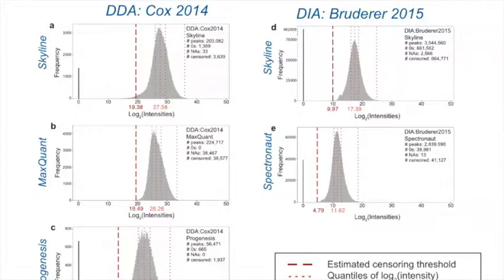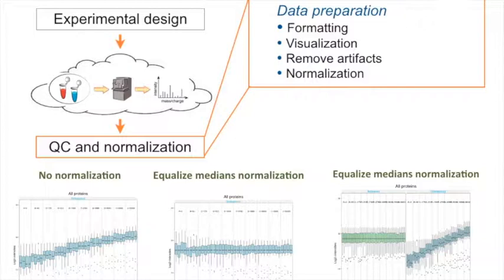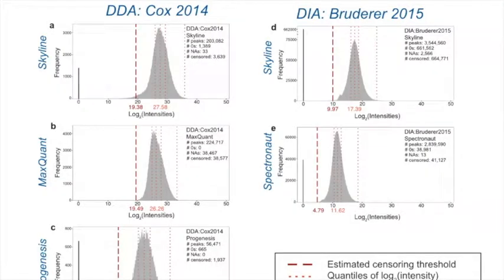Maybe one last thing is that one place where we usually don't do anything is in experiments which have labeled reference peptides. If you have labeled references, we assume it's unlikely that they will be censored, because if you spike references, you will probably spike them in enough concentration to actually see the peak. So if a value is missing here, it's more likely missing for some other reason than low concentration. So we would not do anything with labeled references either. But for endogenous, unless someone tells us that the reason was other than low concentration, we will assume the missing was due to low concentration. So both zeros and NAs are considered low values, for lack of more information.